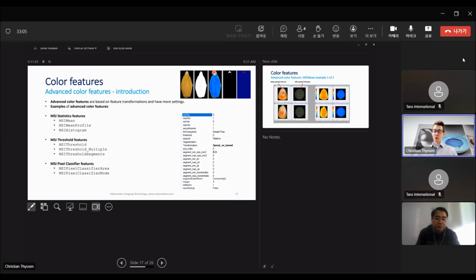Exactly, and you're right. That's exactly what we're actually going to do now. So we segment the entire grain, and then we only look at the top part to find that. So when we use the blob function, between the whole grain and some part of the grain, which method is better? I just question.